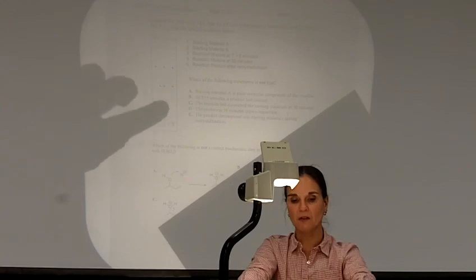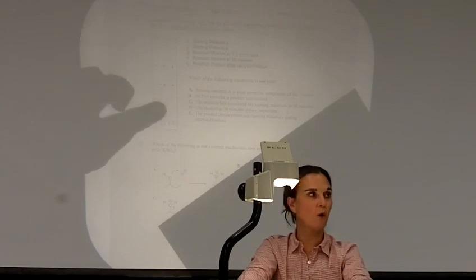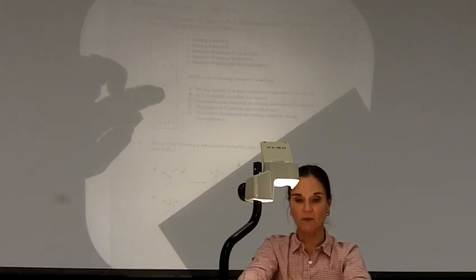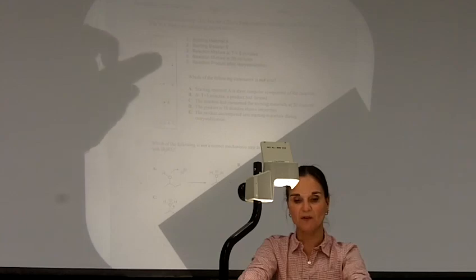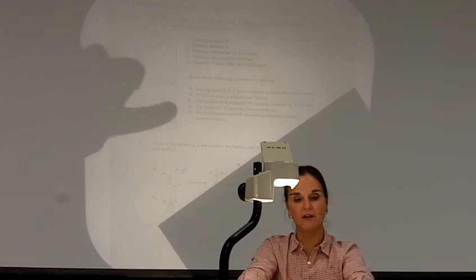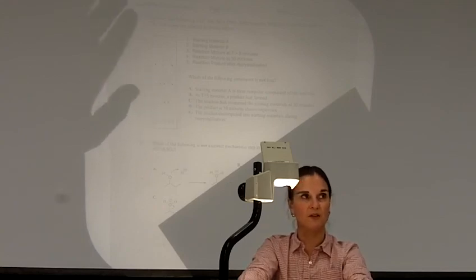Do we have any impurities in here? We just have one spot, right? So that is the answer, D. But let's look at E. The product decomposed into starting materials during recrystallization. So here's our recrystallization. We no longer have our product spot anymore. It had decomposed back to its starting materials, okay?